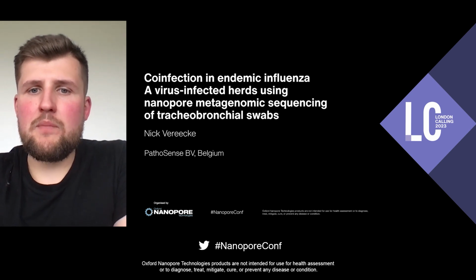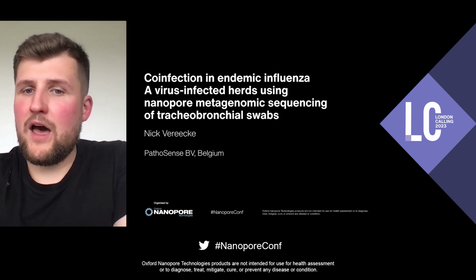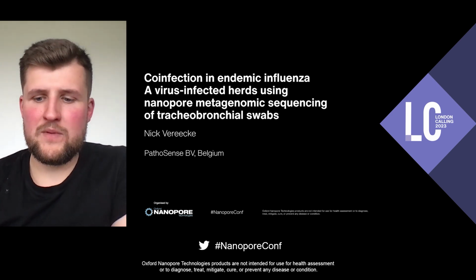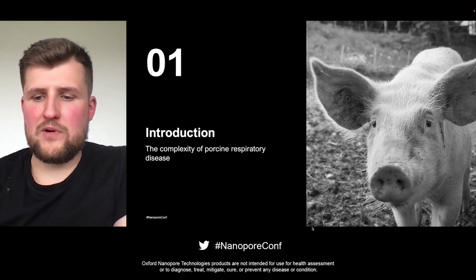Today I'm going to talk about co-infections in endemic influenza A virus infected herds and how we use nanopore metagenomic sequencing to study the viruses and bacteria present in tracheobronchial swabs. Let's start with a short introduction on the complexity of porcine respiratory disease.